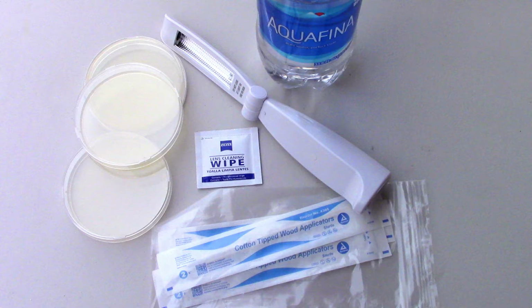So it comes with several of the Petri dishes, but I'm just using 3 for this experiment. Comes loaded with the agar already, and then sterile cotton-tipped wood applicators. I got a bottle of purified water unopened so that we can take out the factor of any contaminants that might be in the tap water. And then in the center, we've got a lens cleaning wipe that has alcohol and a detergent on it.